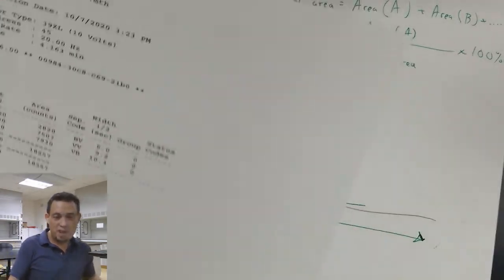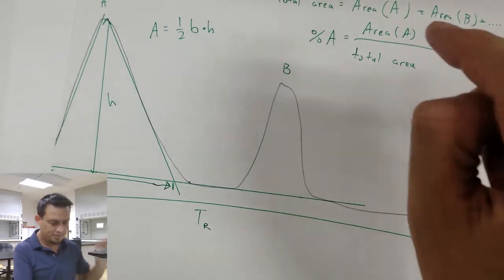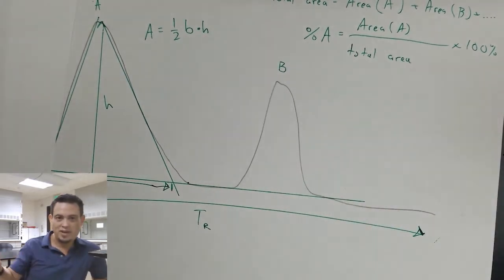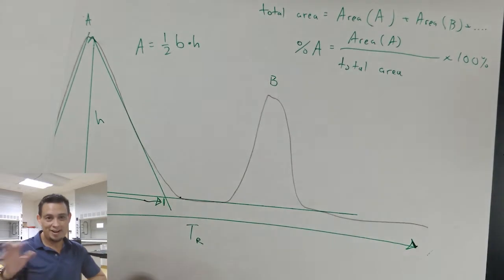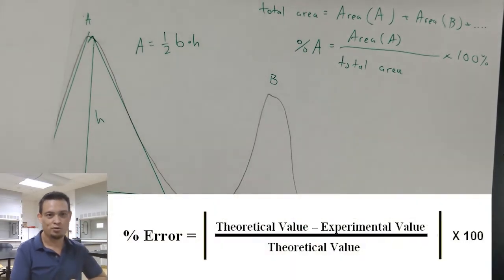So what I would have my students do in this case here, remember, ask your instructor to see if they want it this way, is I would have you guys calculate what the percent composition should have been from the actual volumes of the different alcohols that we have in there. I think it's 2 to 2 to 1. You'll see in the actual later part, but you can calculate what it should be, and then you calculate what you got from the data, and then do a percent error calculation, just like you did back in your freshman chemistry course. And hopefully you guys remember how to do percent error calculations. If not, there's Google.